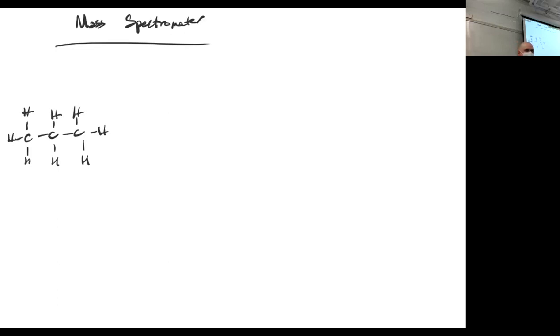Mass spec gives you different information, the primary thing being the mass of the molecule. So we'll get into some little details that it tells you. There's a few things that we can figure out by looking at it, and a few things that we can deduce after knowing that previous stuff. But the number one thing is the mass of the molecule. Just like on Friday, my primary interest in this class is not that you know exactly how the instrument works, but be able to interpret the data that it gives you and turn those data into information about the molecule.